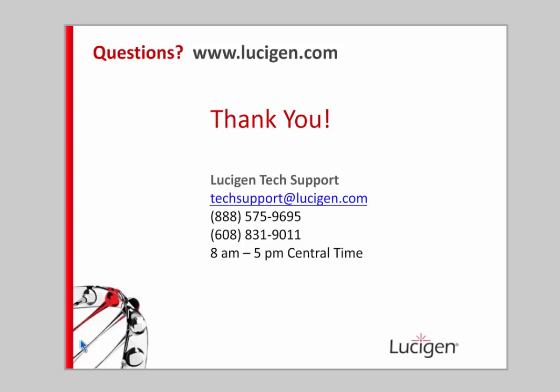So T7 is going to be highest, then the Rhamnose, but we definitely get the ability with the Rhamnose promoter to be tunable, whereas the T7 promoter is on or off, right? There's really not a gradient there that you can achieve. So if you're too high with the T7 promoter, it's going to be difficult to modulate that, where you can use the Rhamnose promoter to modulate your expression. And I should also mention that here at Lucigen, our R&D team and our production teams use the Rhamnose promoter preferentially over the T7 promoter for just those reasons, actually.